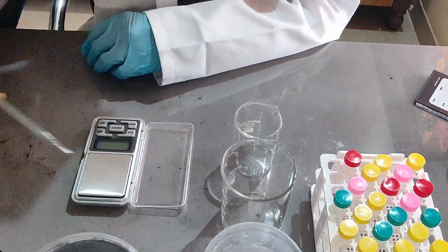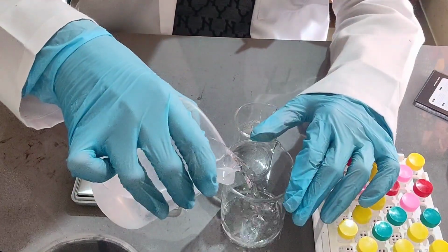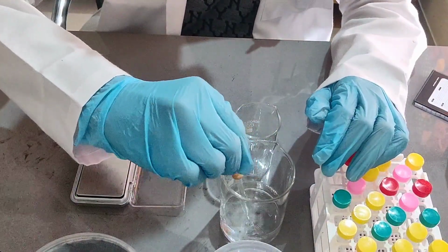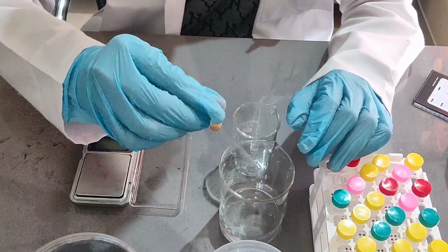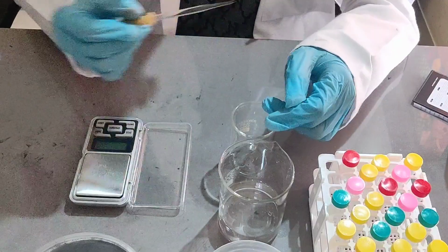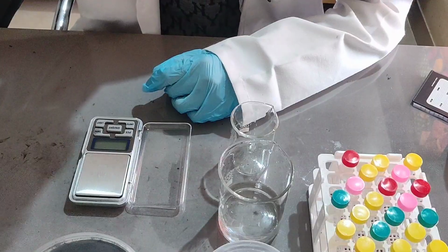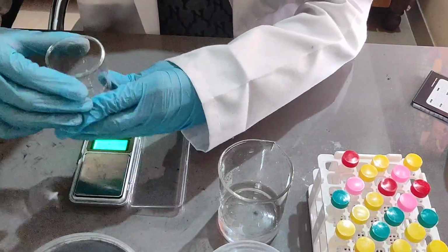I have to be really careful though. Just wait a little bit. I'm just cleaning this up for good measure. It's clean now. The tip needs to be clean. Okay, let's start experimenting then.